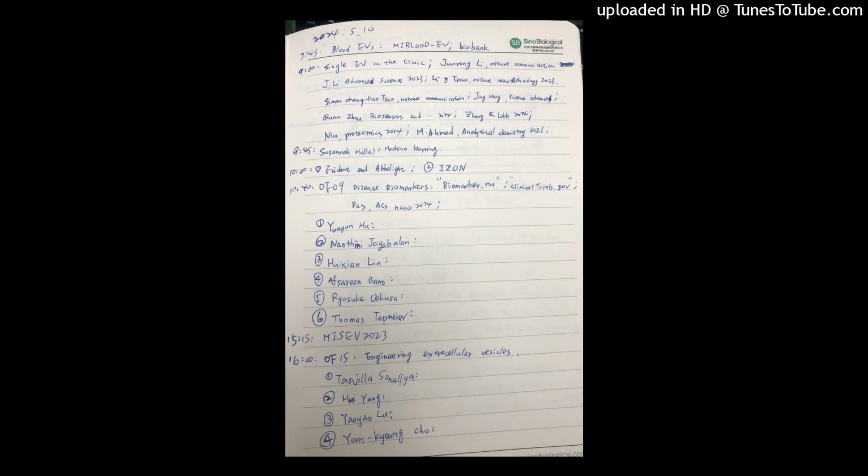Thus, we just extracted 7 fluorescence parameters from each EV sample and conducted the t-SNE analysis, and we observed that distinct differentiation of the 4 EVs, including 3 breast cancer subtypes and the normal cells, can be achieved.